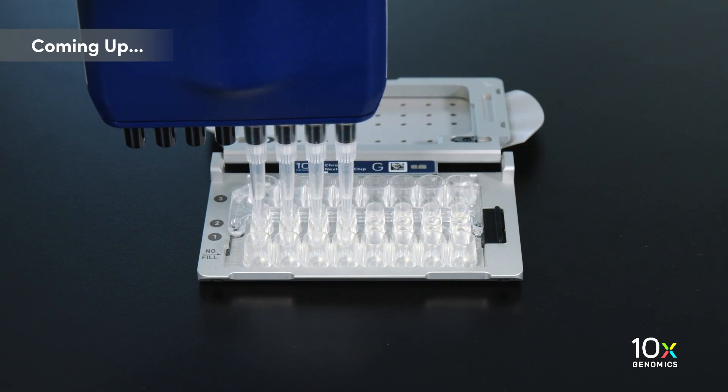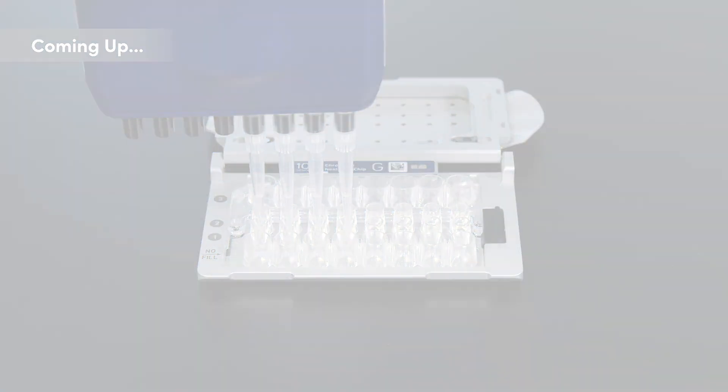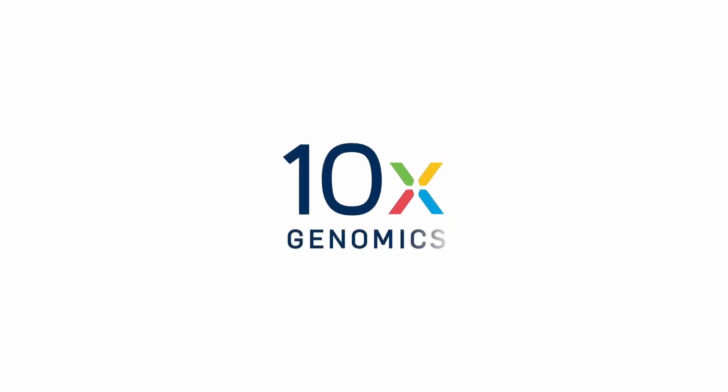We have combined our master mix, water, and cells. Now we are ready to load the chromium next gem chip.